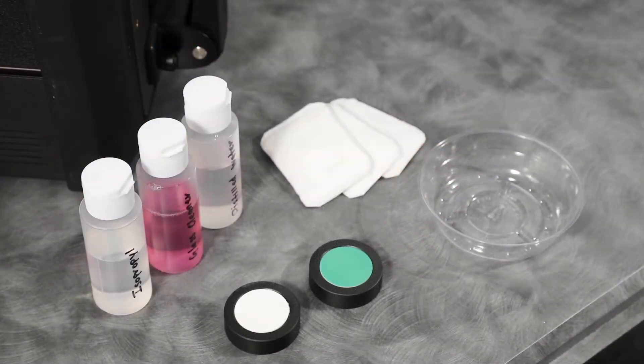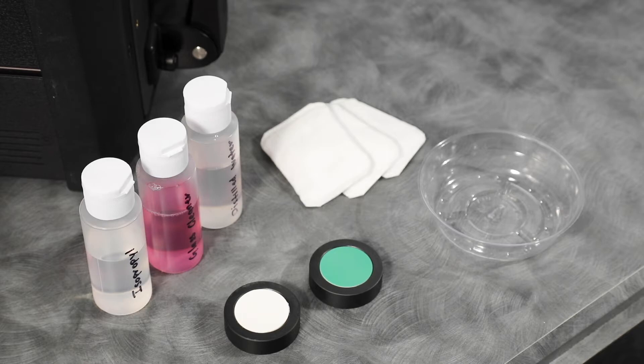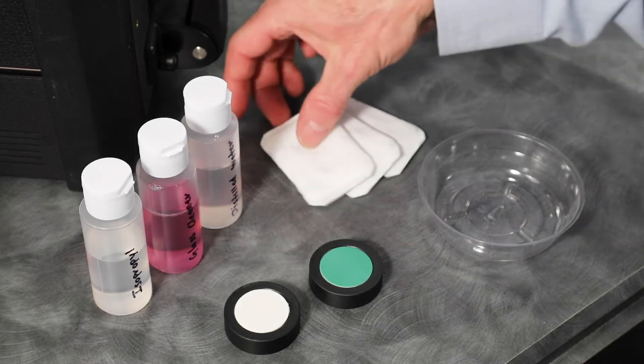To clean your green and white calibration tiles, you'll need the following: isopropyl alcohol, glass cleaner, lint-free wipes, and distilled water.